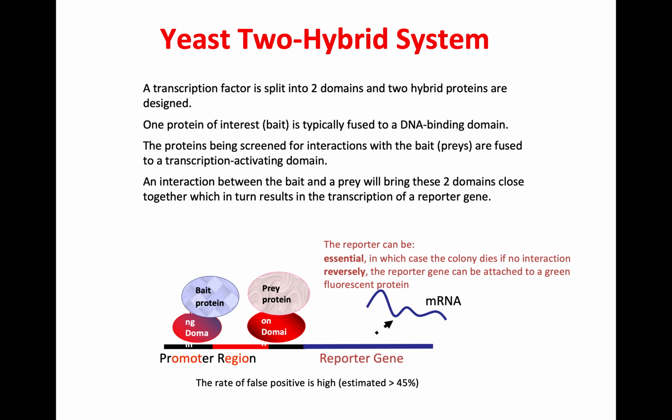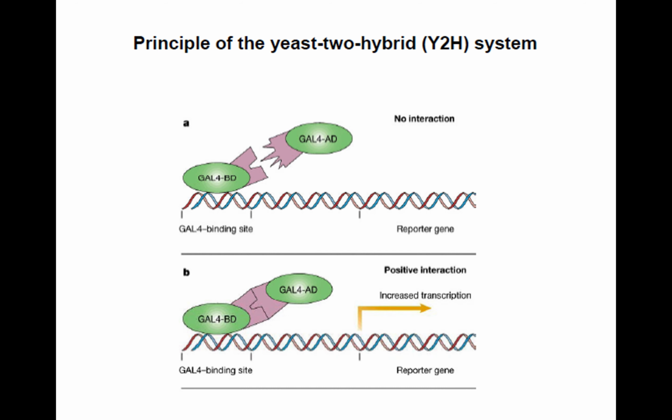Actually, for the yeast system, there are yeast one-hybrid, yeast two-hybrid, and yeast three-hybrid. The most common that we use is yeast two-hybrid. Yeast two-hybrid is typically quite hard to do. When I was working in MPOB, I spent around one year working on yeast two-hybrid, but the result was not that good. Well, that was in the early 2000s, so now they have a better system.